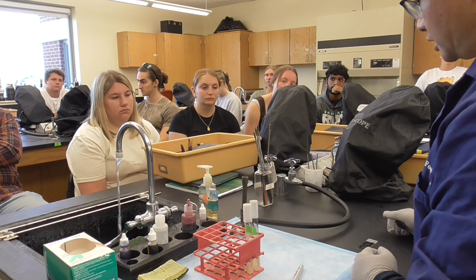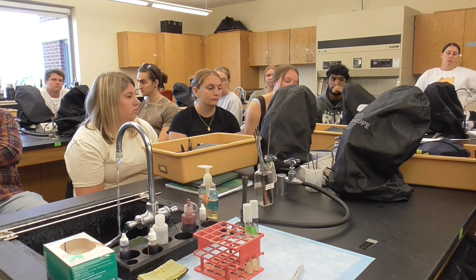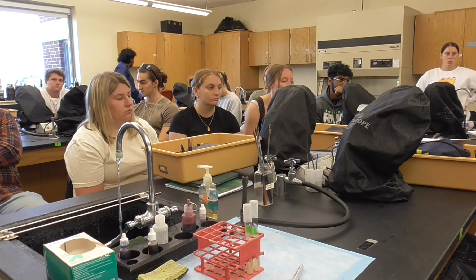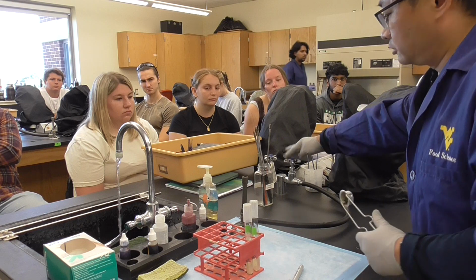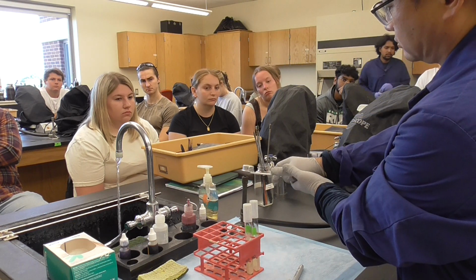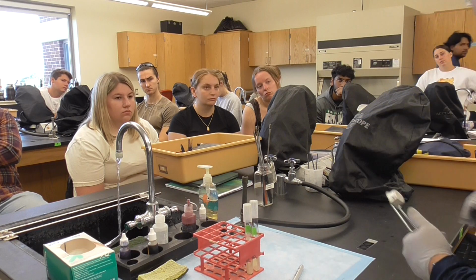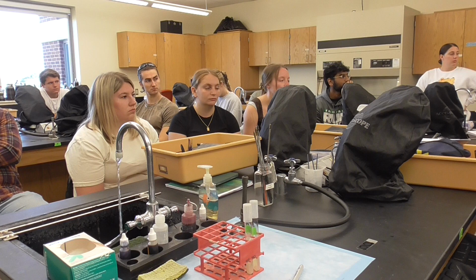Now we're going to practice using the Bunsen burner again. We need to make sure we have a hockey stick. Hopefully the gas is working. If it's not working, you turn it off immediately. So the gas, we'll try that.